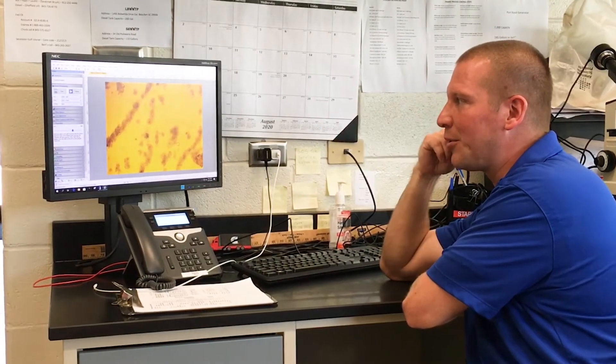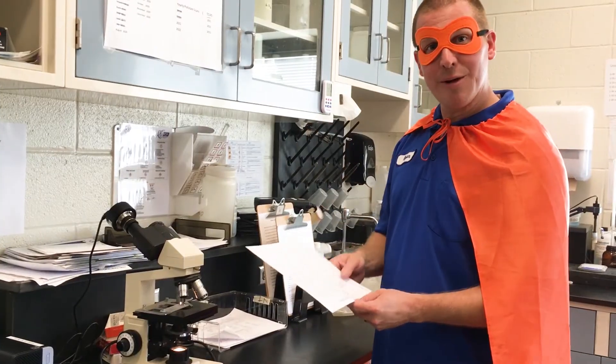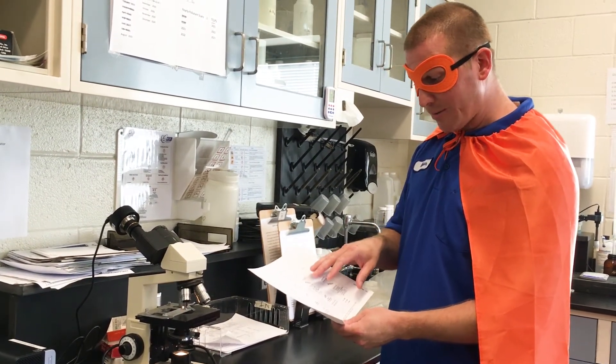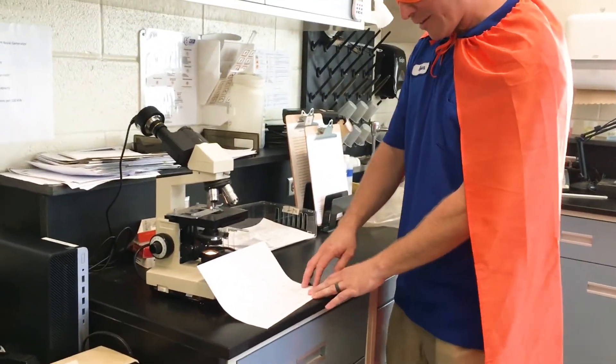What we're doing today is we're looking at the bacteria in the wastewater that actually eat the waste that comes into the treatment plant. Here we have our microscope, which we use to take a sample from the aeration basin. We can identify all the microorganisms and bacteria that eat the incoming waste, and these will identify what type of treatment process you have.